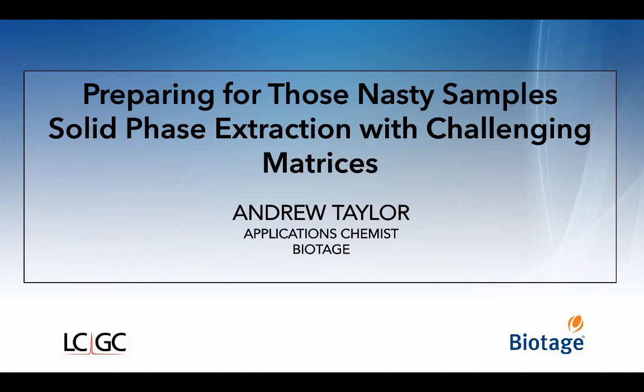needs to be analyzed. Should you use a 47 millimeter disc or a 90 millimeter SPE disc for extracting the really challenging samples? When doing EPA method 1664, you always want to use the 90 millimeter disc if you're analyzing dirty samples. The larger surface area of this disc provides higher flow rates, and it's also more difficult to clog. The same idea applies for 625 and 608.